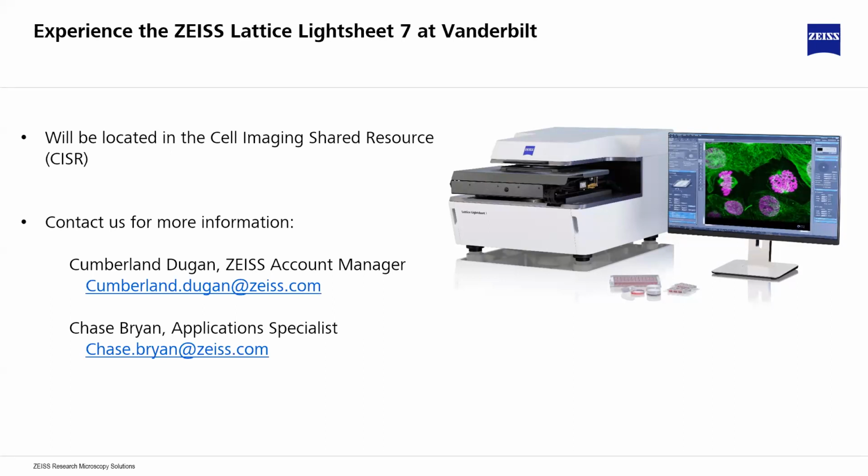So the Fusion is better than Orca Flash. The Fusion is, my understanding, the next in line on the Orca Flash line. Yeah, so these are definitely state-of-the-art, highest end cameras we could equip the system with. The best thing they can be. I think it's 8.6.